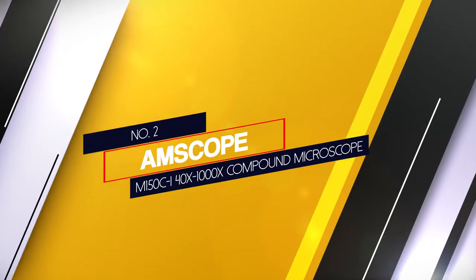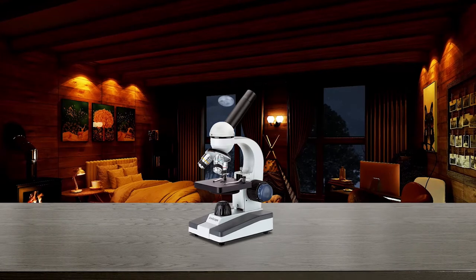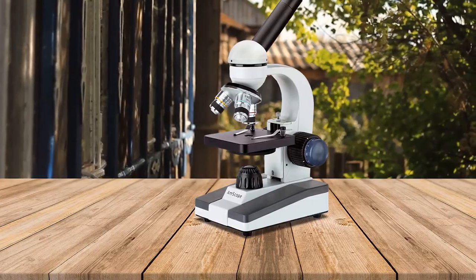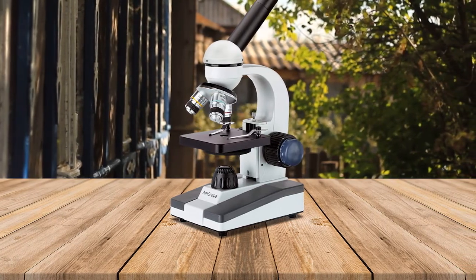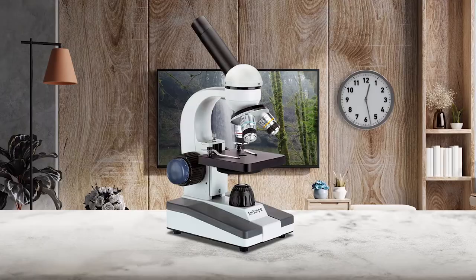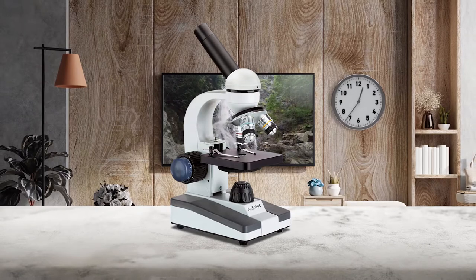Number 2: AMscope M150CI 40x to 1000x Compound Microscope. This is an ideal microscope to learn science. The metal body makes it durable, and the unique feature is that the monocular head can be rotated 360 degrees. This microscope offers 5 magnifications: 40x, 100x, 250x, 400x, and 1000x. The magnification quality is very good — you can even observe the movement of sperm with this microscope. It is suitable for laboratory placement, and not only students but also adults and teachers find it suitable for educational purposes.